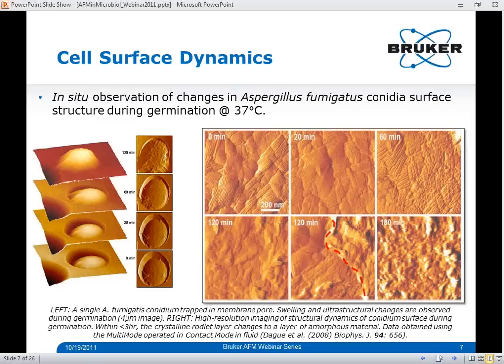Images on the left-hand side show changes in the gross morphology of the cell during germination. We can see significant swelling of the conidia as it protrudes more and more from the pore over a span of 120 minutes. High-resolution imaging of the surface of a single conidia spore during germination, shown on the right, reveals the crystalline structure of the rodlets at zero to 60 minutes. After about two hours, dramatic changes occur as the rodlet layer begins to transform into amorphous material, consistent with previous studies suggesting that disruption of the rodlet layer reveals inner spore walls composed mainly of hydrophilic polysaccharides.